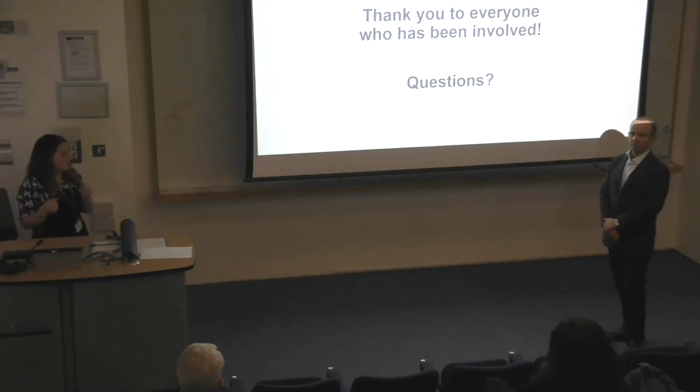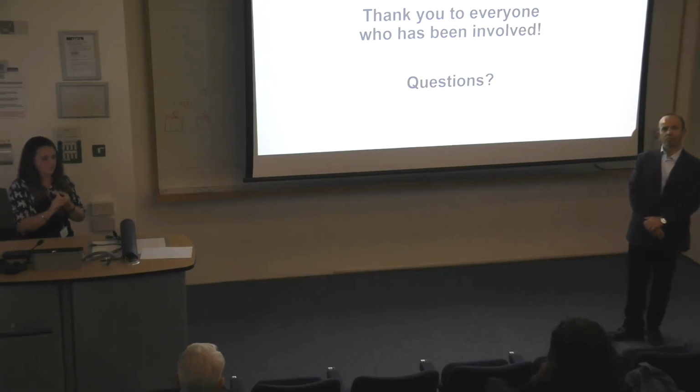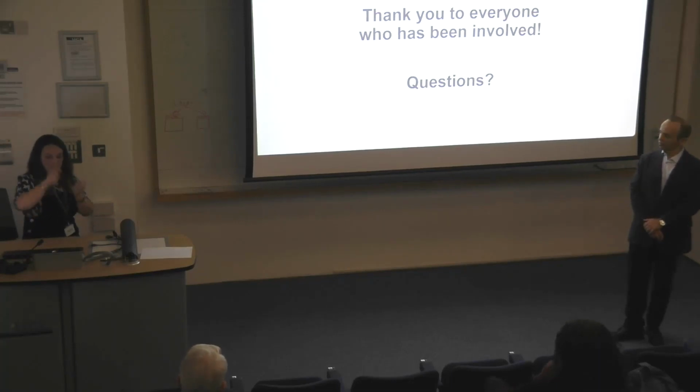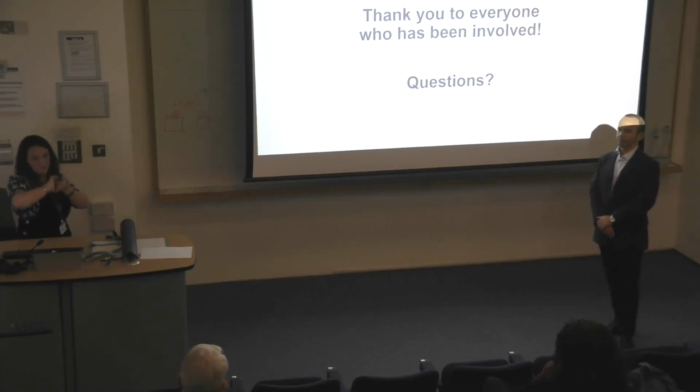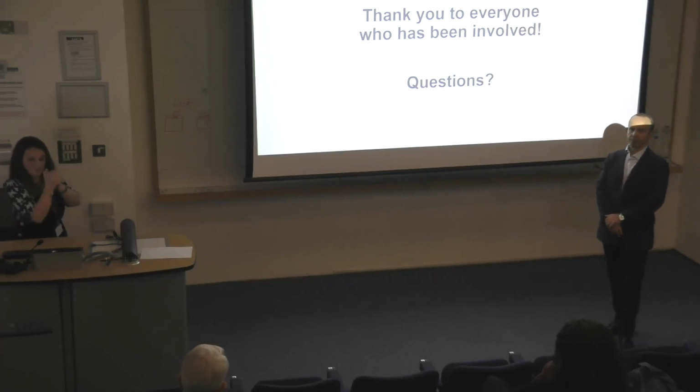And I went to a sequencing talk at the Crick, and there was a team there who had a very AT-rich protozoan parasite genome, and he was having a very similar problem. And he said that it was probably because this thing had a lot of repeat regions, because what happens is when it goes through, this other sort of piece just sort of floats around. And I think what it probably does, a bit like with PCR, is it forms these balls and it probably gets stuck.